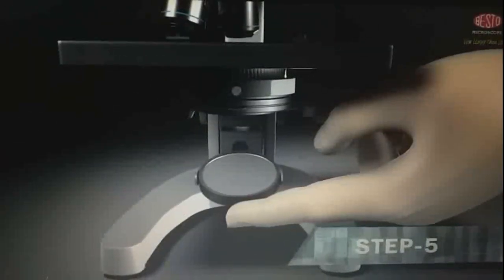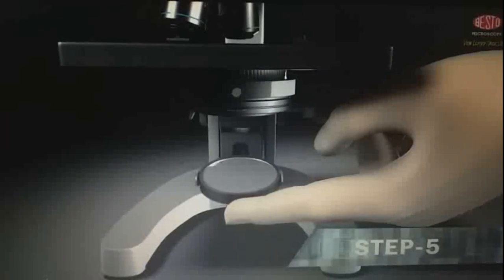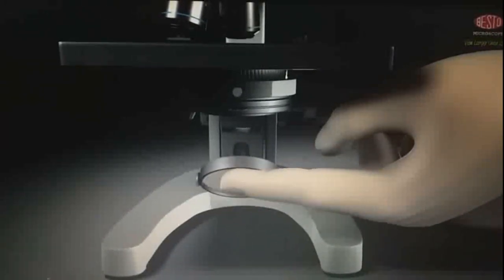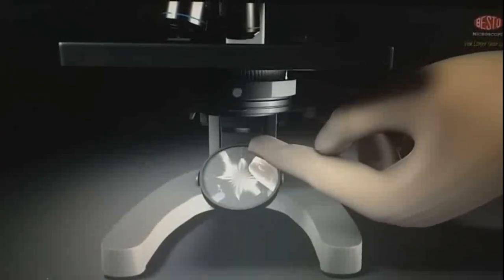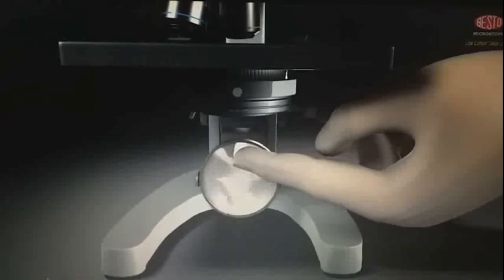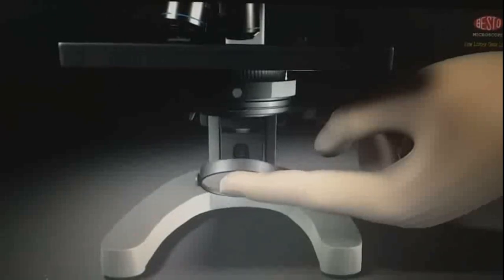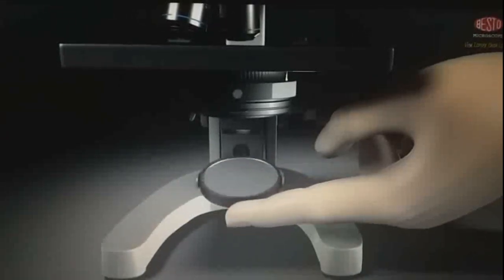Step 5. The reflector has one side flat and other is concave. Flat side will provide sharper image in most of the cases, while the curved side provides a brighter image. You can touch and feel the curved side and the flat side.